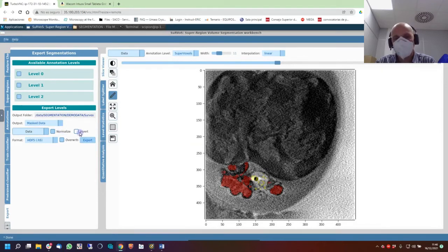Then for Chimera visualization, I normally get it inverted. As you can see here, in this tomogram the data absorption is black. And sometimes Chimera prefers not absorption, but just transmission. So therefore, it's better to make it white. While it will make our life a little bit complicated at the end, it's better.